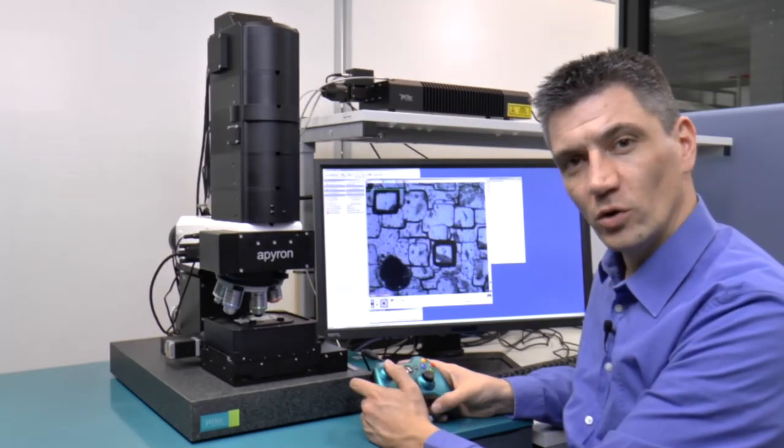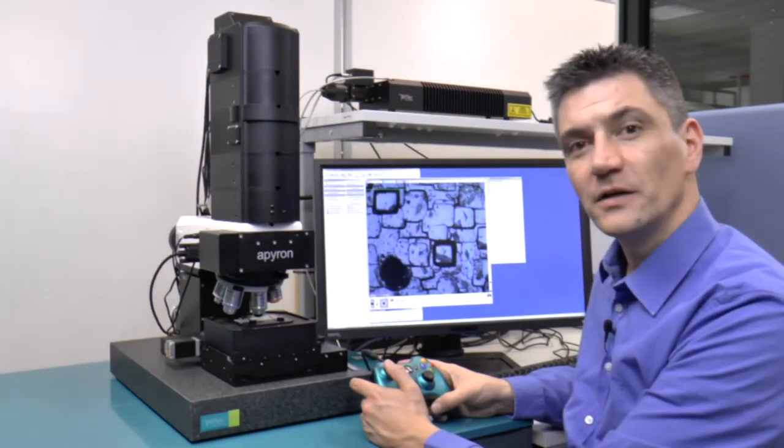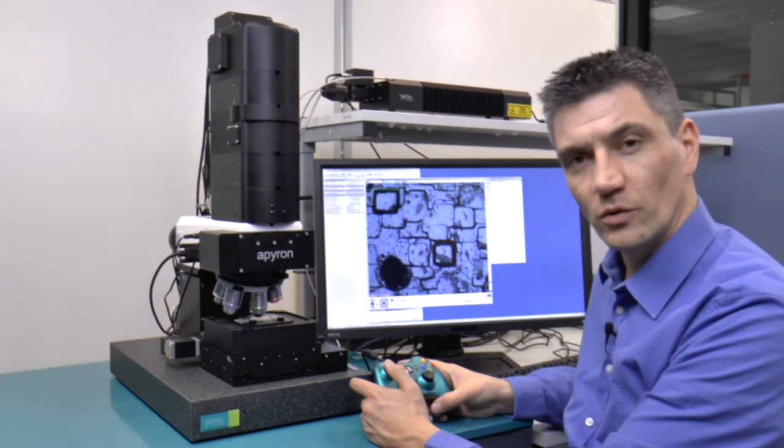The EasyLink control also allows you to control the motorized turret. Like this, you can choose which objective to use for your measurements.